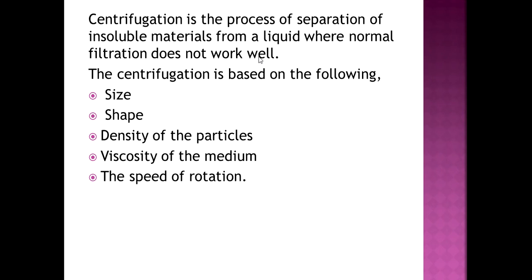Observe that some very tiny particles are able to escape through the pore space and escape again with the liquid instead of being retained. That problem has been solved by using the centrifugation method as a basic method of separation.